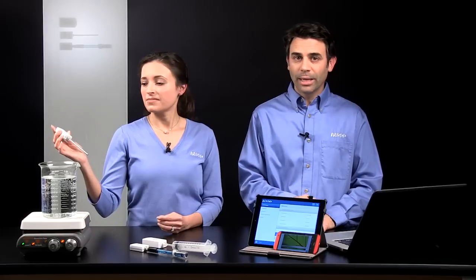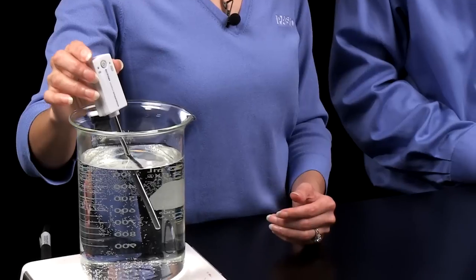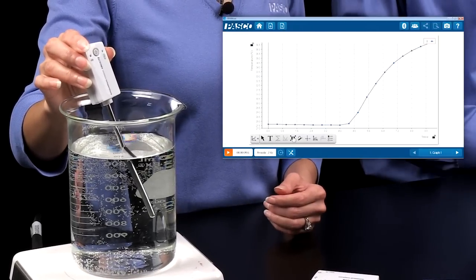So seconds from turning it on, to pairing, and connecting, to collecting data. And the hot water bath. We can definitely see that temperature change.